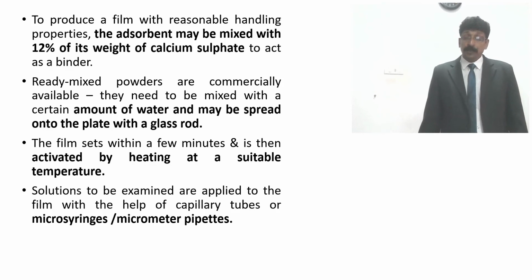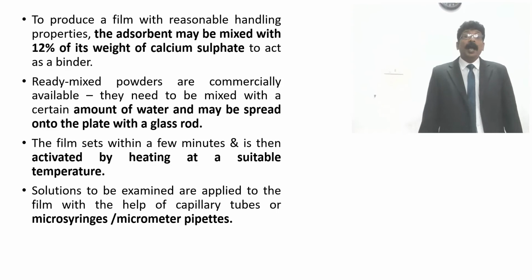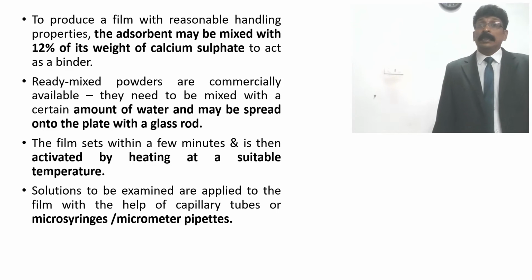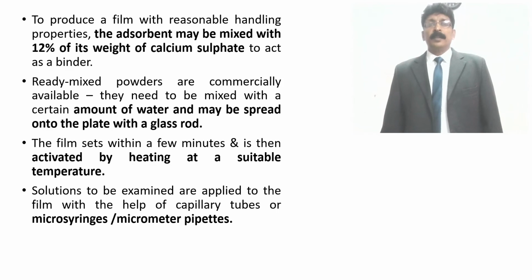Usually 110 or 115 degrees centigrade for 15 minutes will be more than sufficient to make the adsorbent, the stationary phase, activated and ready for the preparation of the chromatogram, ready for the separation of the compound by means of its adsorption capacity.